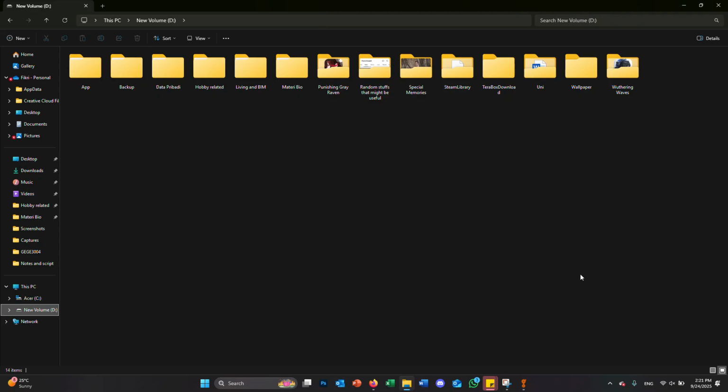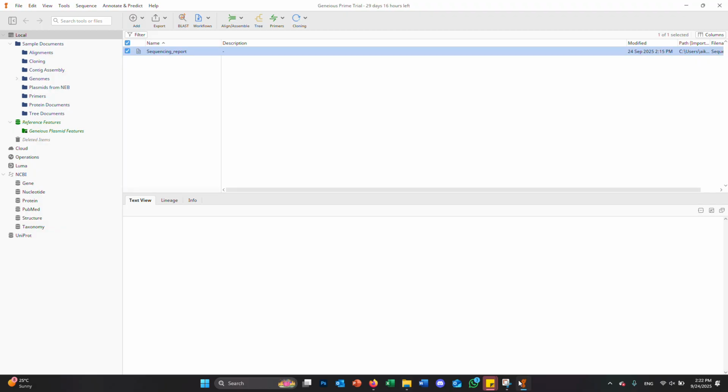So, Phred is the original software that was used to determine the DNA sequences when the Human Genome Project began. So it's quite an old measure, but it's been maintained in the decades following. We often set a threshold to around 20. That means you've got a 99% base call accuracy if your Phred score's around 20, but most often you're working with data that's 30 or above.